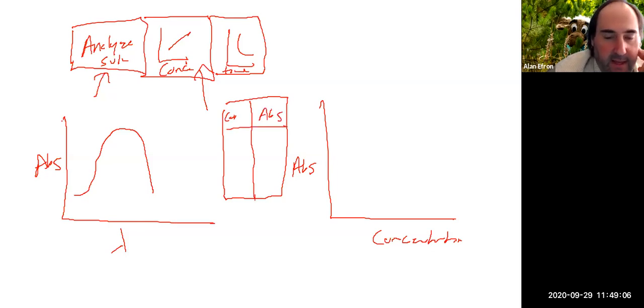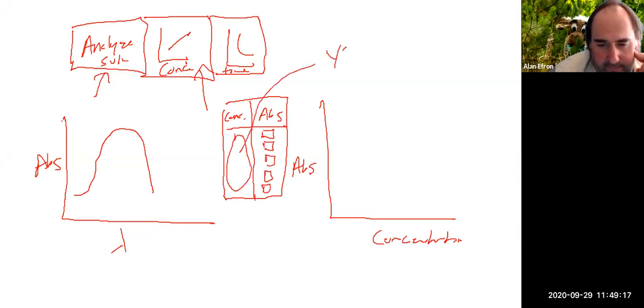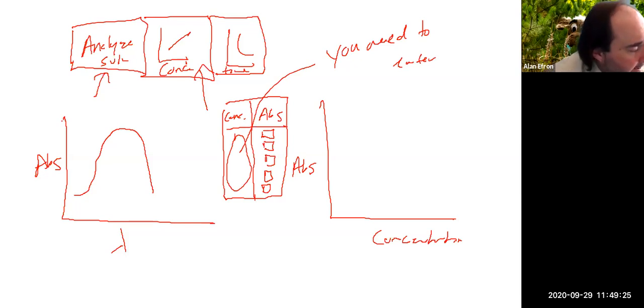And again, you'll have a table to the left here that will look something like absorbance and concentration. And again, this part of the table will be filled in for you. So this part will be filled in. This part you need to actually enter. And again, you need to do those calculations. It should walk you through those calculations in the procedure. Question on that there?